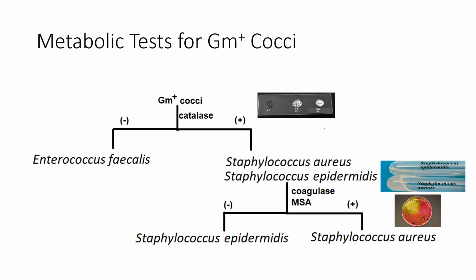Yep, on your skin. Aureus can also be found in the nasal passages. The skin and the nose are highly oxygenated environments. Organisms that live in highly oxygenated environments have got to have mechanisms of dealing with reactive oxygen species, so I'm not really surprised that they are both positive for catalase.